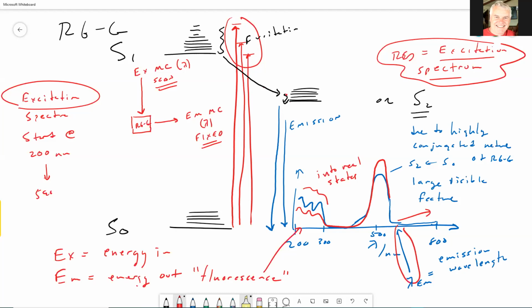And so basically, the sensitivity of fluorescence depends on how efficient the molecule is in emitting light. So, for example, with rhodamine molecules, you can literally detect a single molecule. That's 10 to the minus 23 moles. That's just ridiculous, a ridiculously low concentration.